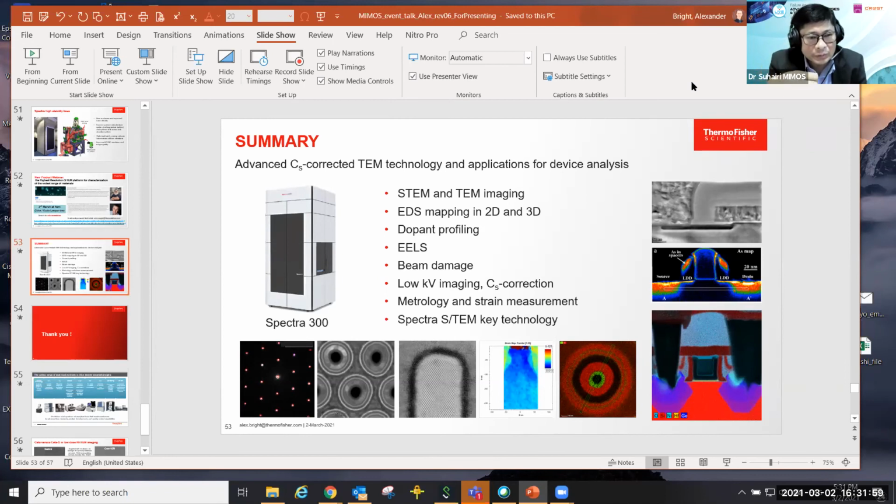If someone were to install, as you know, that TEM, they have this tower, and the preparation for the site will be quite extensive, if not expensive. What would be the site preparation required for installing TEM equipment, for example?